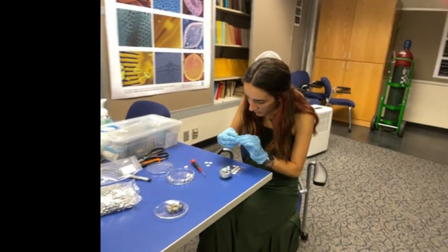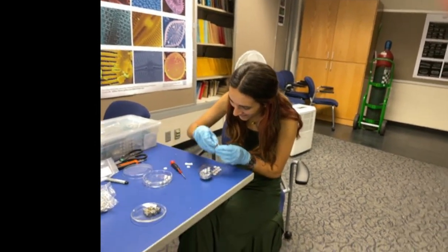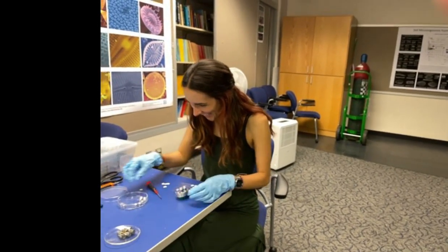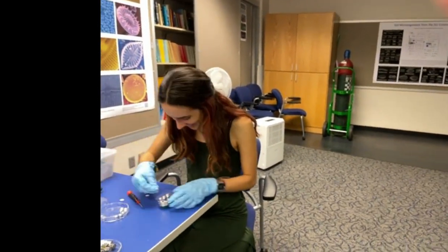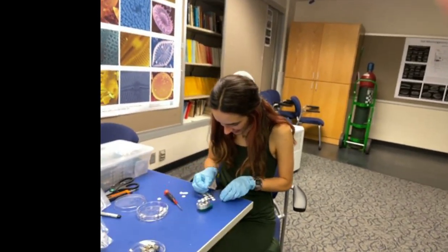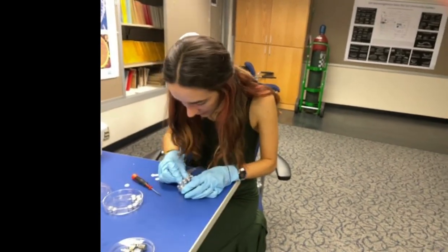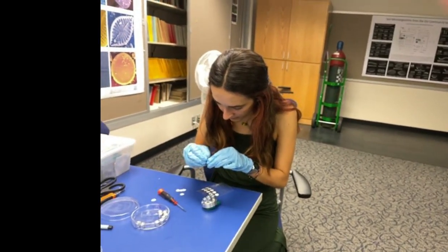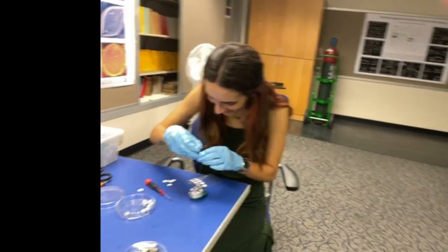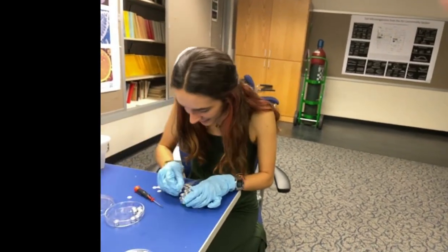The hardest part of this whole process is peeling off the little sticker covers with gloves on, which Laura's doing an excellent job with right now, because usually you need fingernails, or I sometimes will just use the forceps to peel back the sticker tapes. But she's doing great. She's not even needing that, so that's a mark of a true professional right there. She's got it all under control.